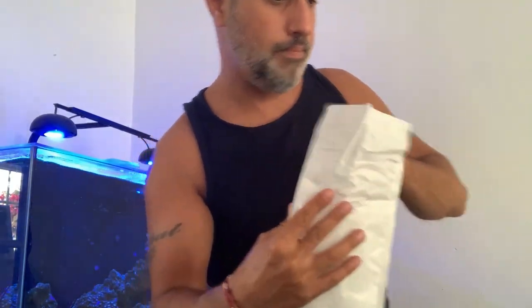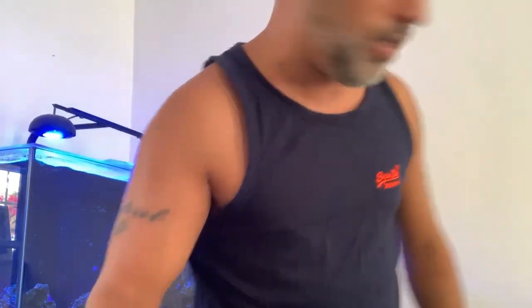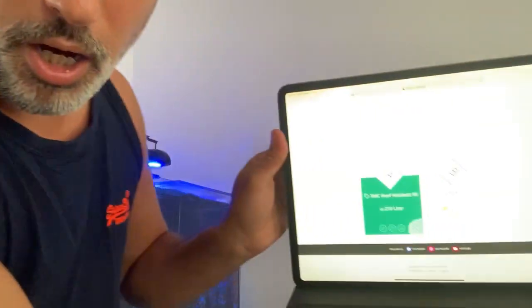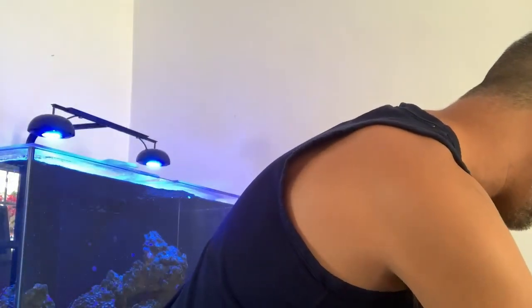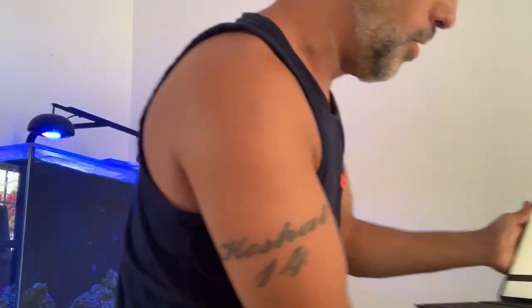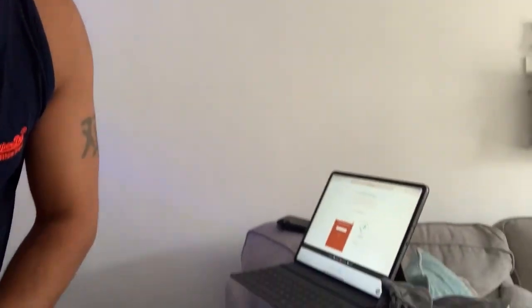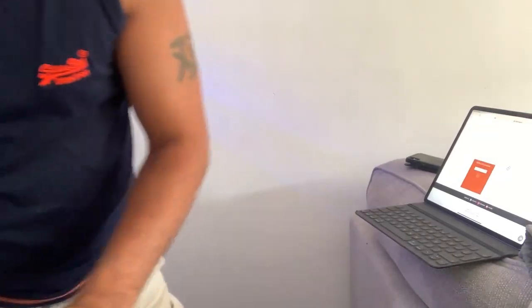We're going to pop them in the envelope — we won't be posting it just yet. I totally forgot I need to put a large stamp on that, so I'll get Mrs. Neil's Reef Aquarium to grab one when she's back. Right, so now what we've got to do is go on to the iPad here. It's very straightforward — I've got one set up already and it just says enter the barcode.